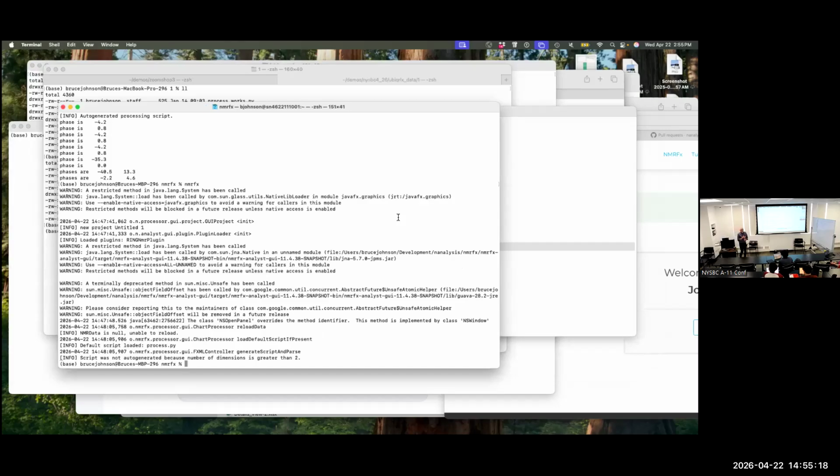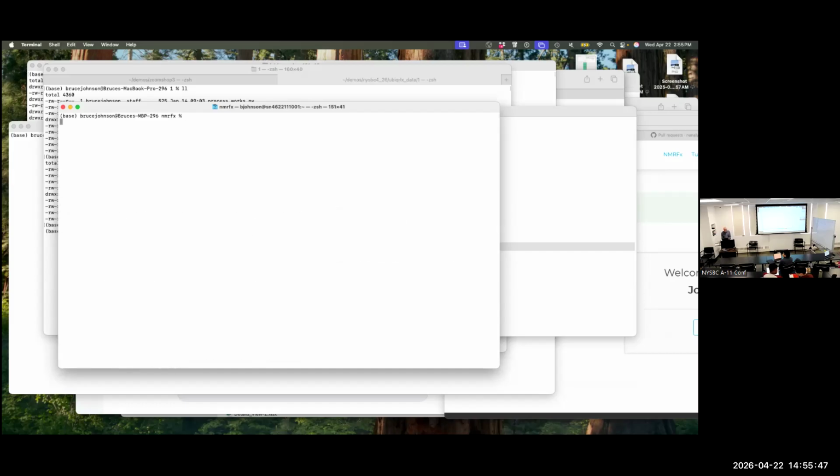So we've processed the FIDs: the one-dimensional FID, the two-dimensional FID, and the 3D NUS experiment. Let's actually try to do some assignments. How many RNA people are in there? One, okay. Your protein, a good chance of getting through this, because we have some really nice RNA stuff. I don't know who all's out there. Ring in on Zoom if you have questions.